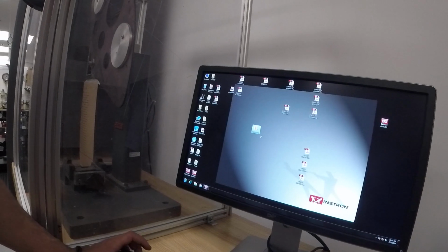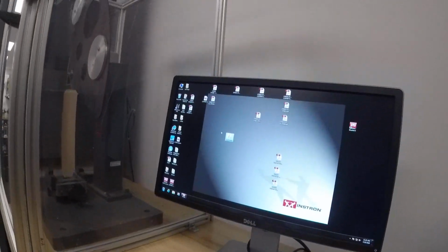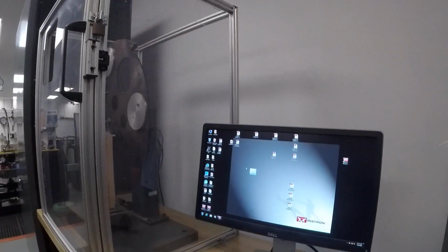So I will share that with you guys later for the lab too. So this is our first sample. Let's start another sample.